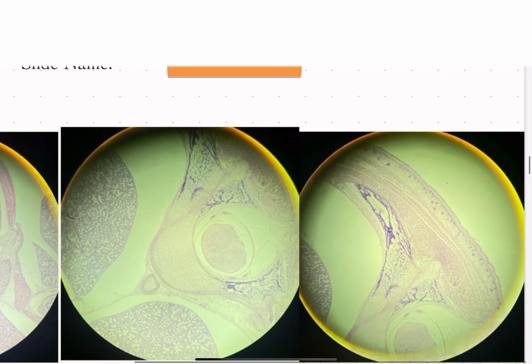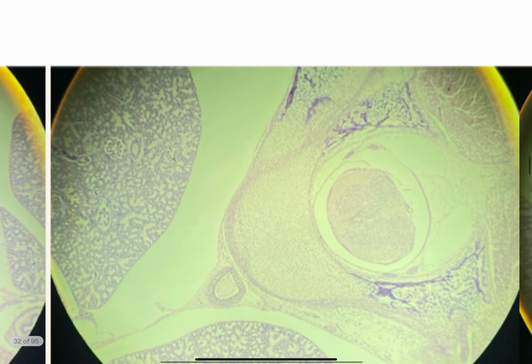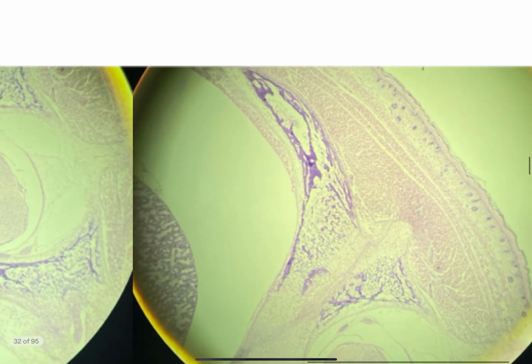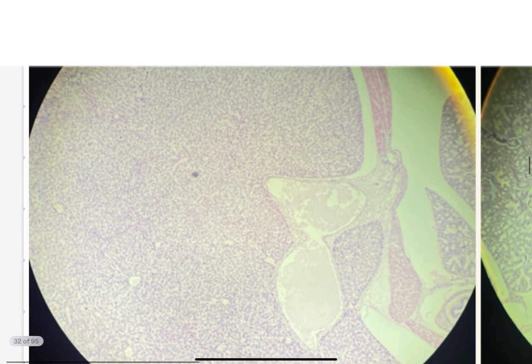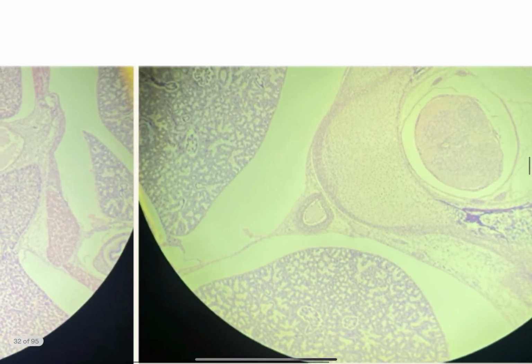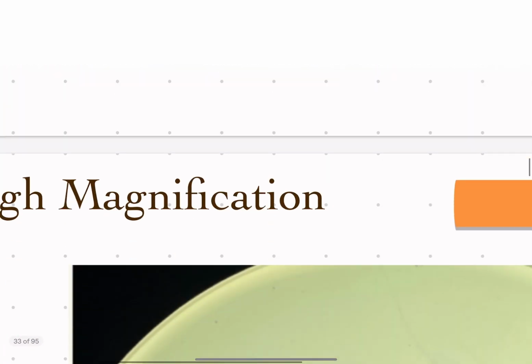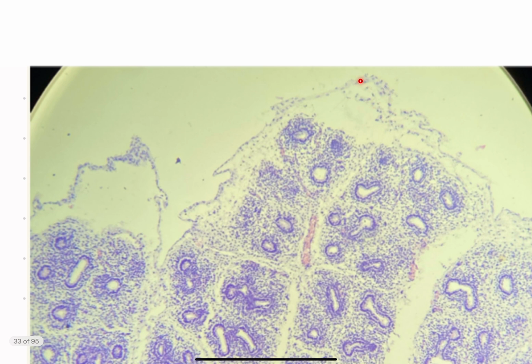Okay, next slide, we see this under the microscope, and then going further towards the left, we see this. Bottom left, I guess. And then more further towards the left, we see this. But we're going back towards this general area, and would like to zoom in and show you this. Please write down the name of this structure. So slide name and structure name, please.